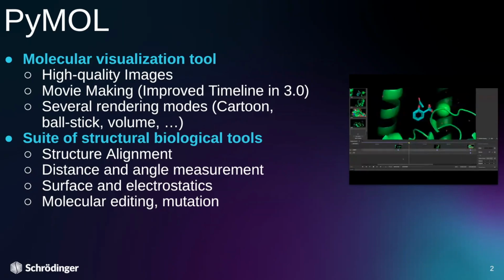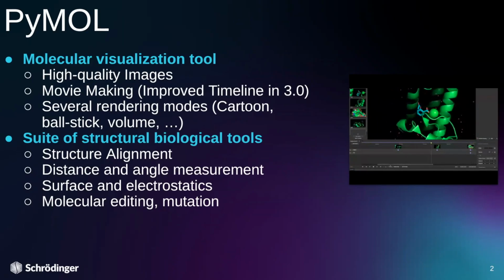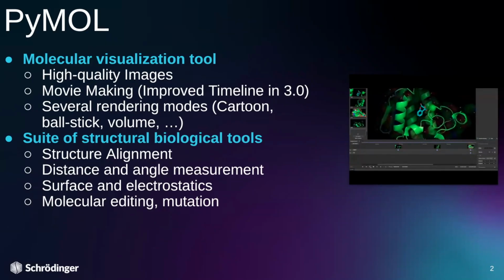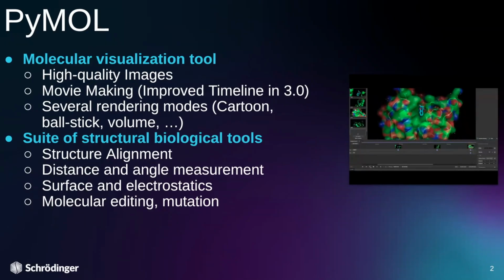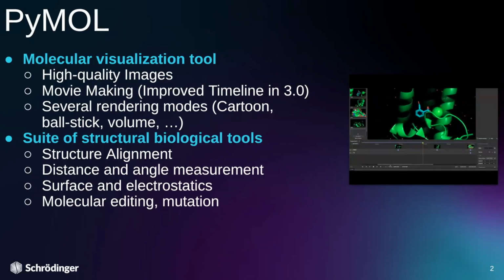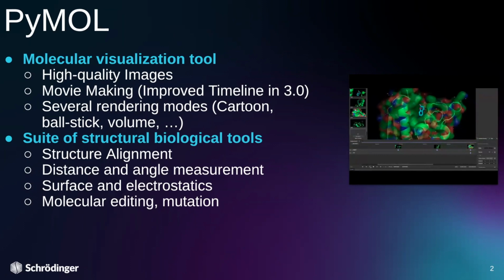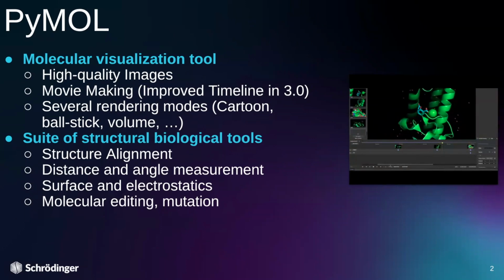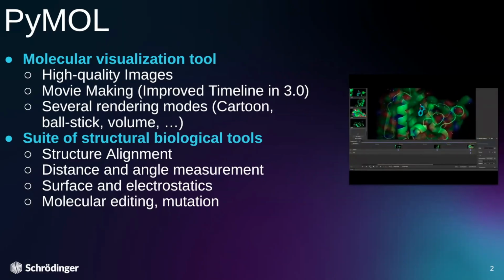I still remember this. It's a slight tangent, but I was teaching making movies in PyMOL and doing a rotation, and I said you can use this as an example for scripting. Somebody asked, why didn't you just use the button for that? I said, yes, you should use the button. The button didn't exist when I learned it. And that's a major thing we're taking with 3.0.